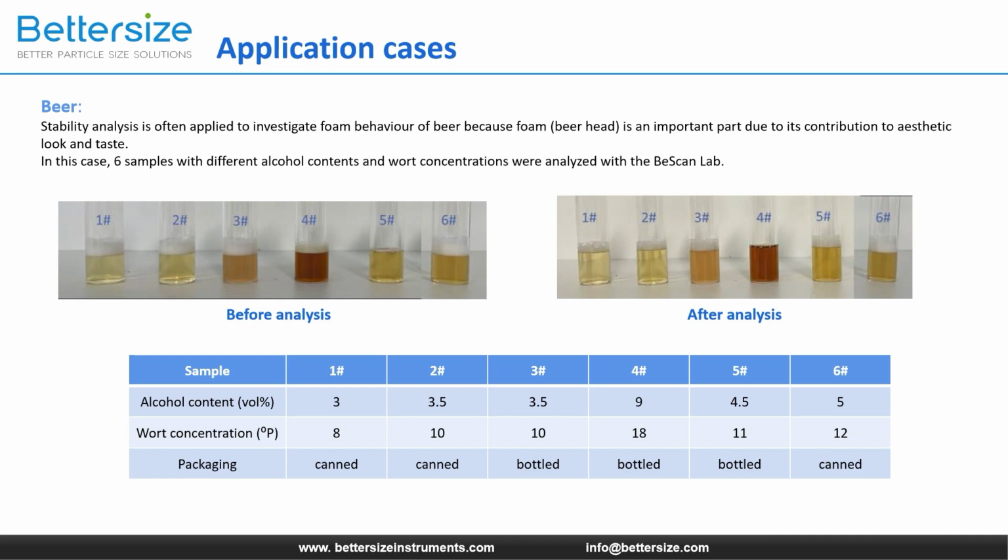The first case is beer. In this case, we investigate how the beer foam changes over time. Customers always associate the beer foam with the beer's quality and freshness. Besides, beer head provides an attractive look, so a stable beer foam is quite important to the manufacturers. In this case, 6 commercial beers with different alcohol contents and wort concentration were measured.